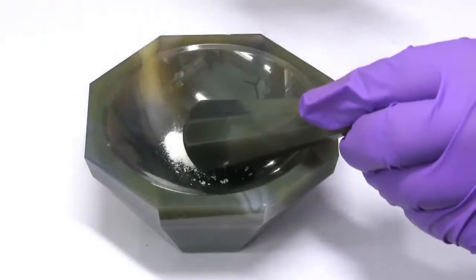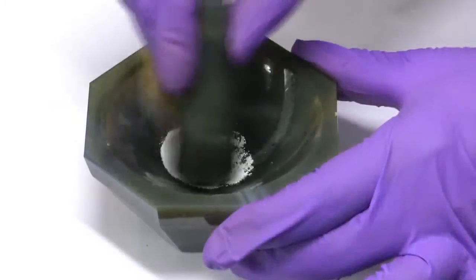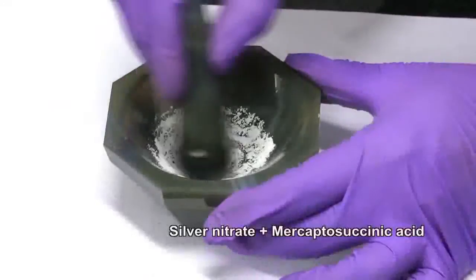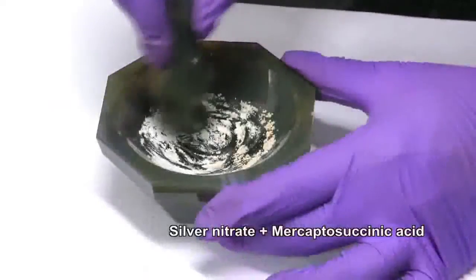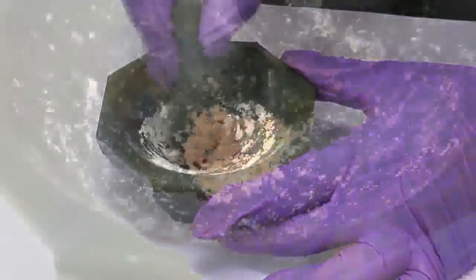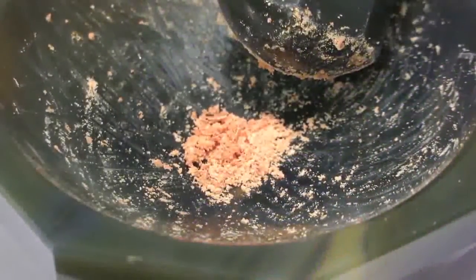A thiol mercaptosuccinic acid was added next and the mixture was ground well. The colorless sample got converted to an orange colored material. This is silver thiolate.